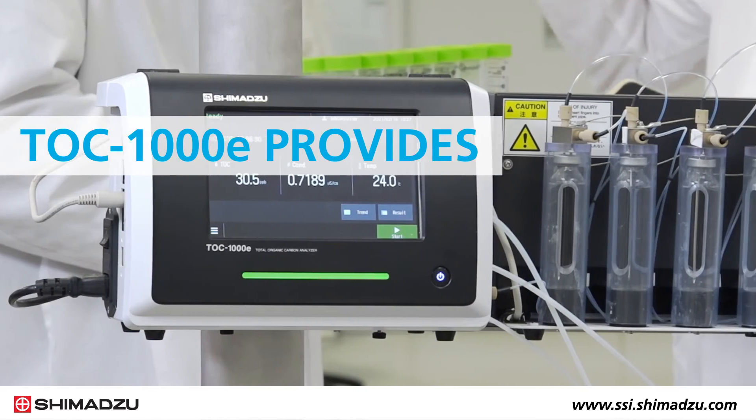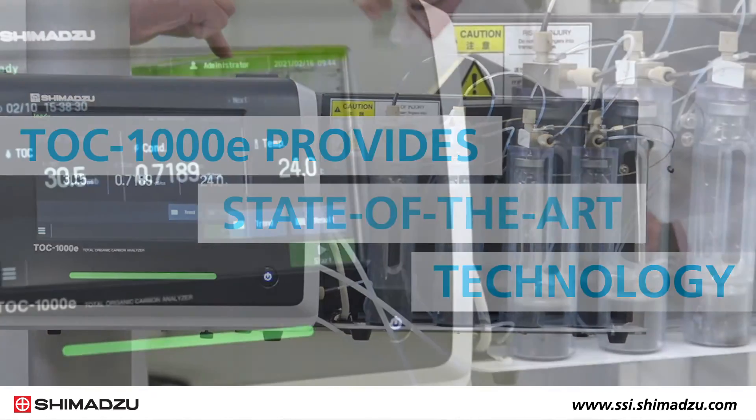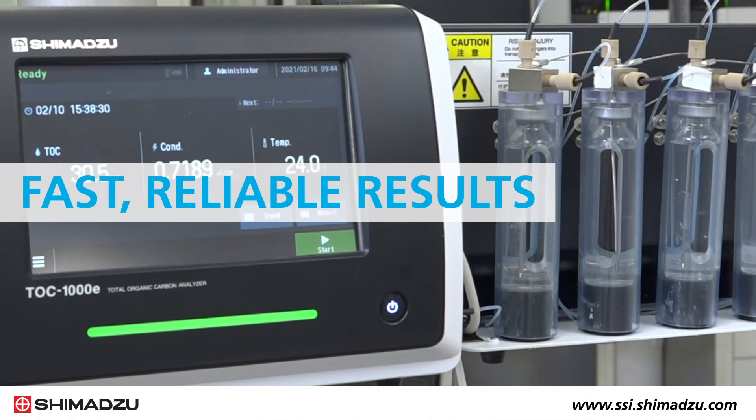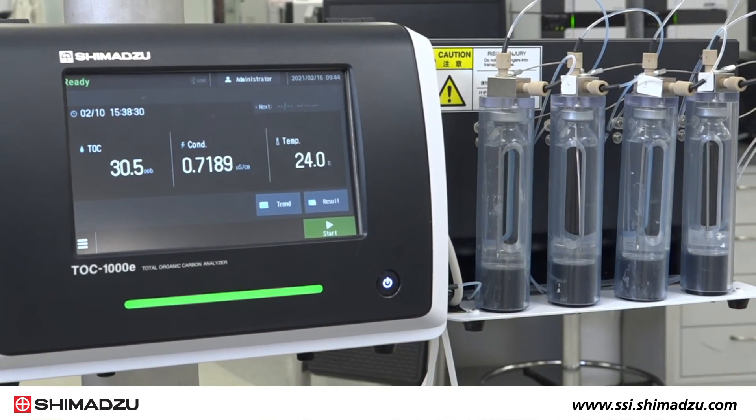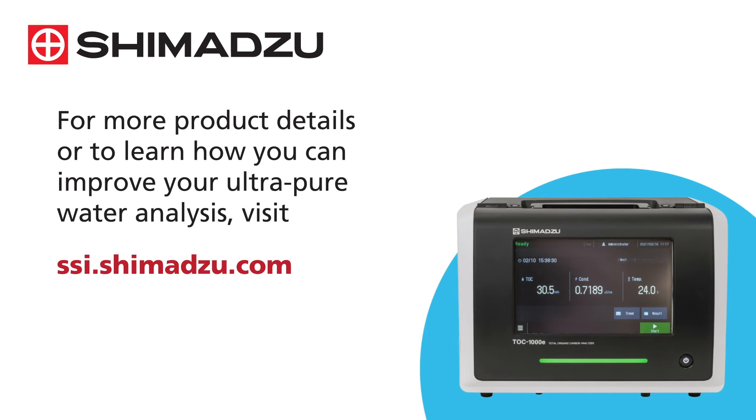The TOC1000E provides state-of-the-art technology in the smallest casing, ensuring you get the fast, reliable results you need for pure water analysis. For more product details or to learn how you can improve your ultra-pure water analysis, visit SSI.shimadzu.com.